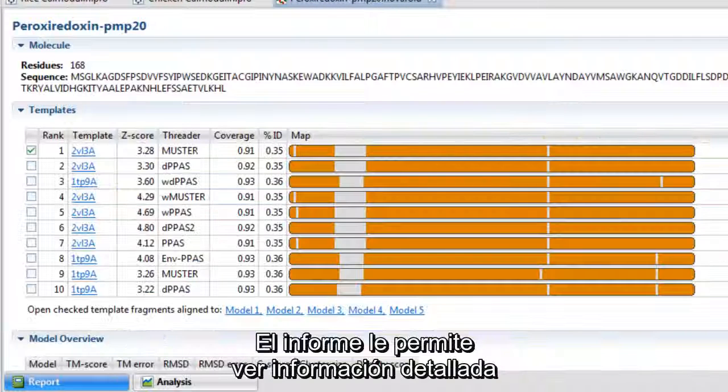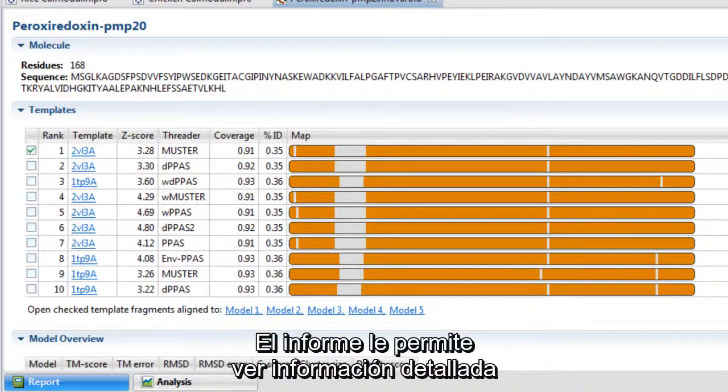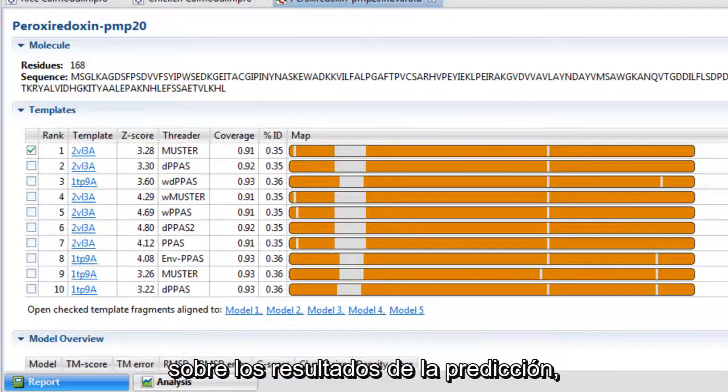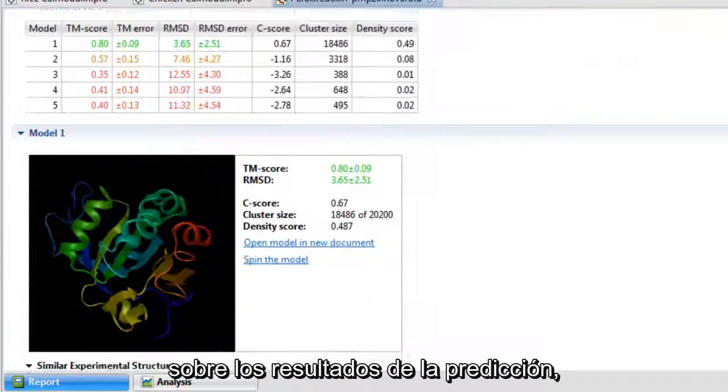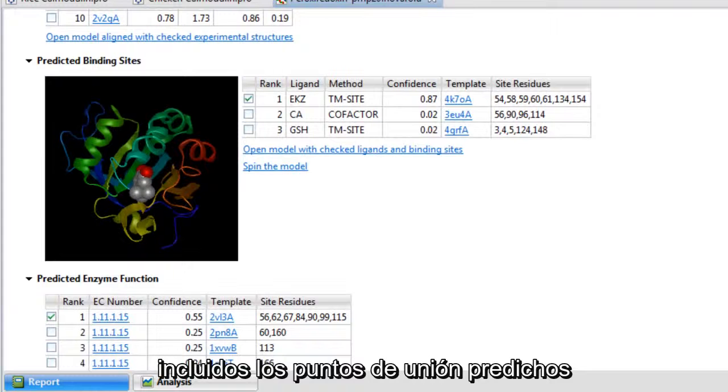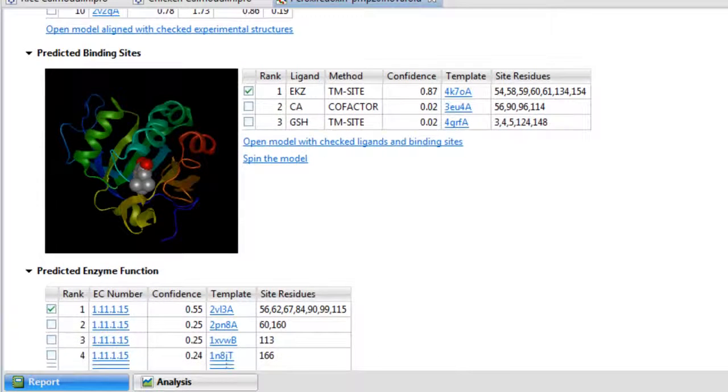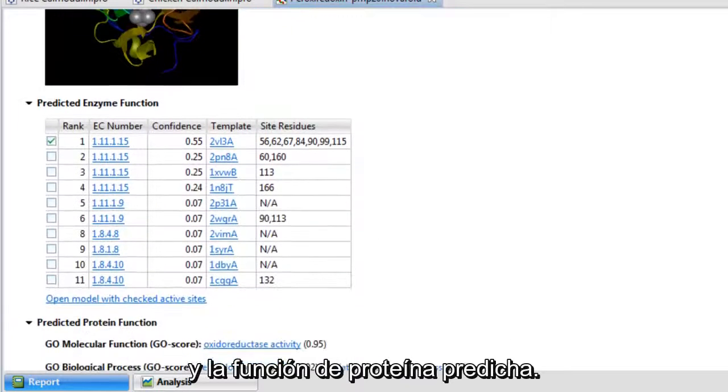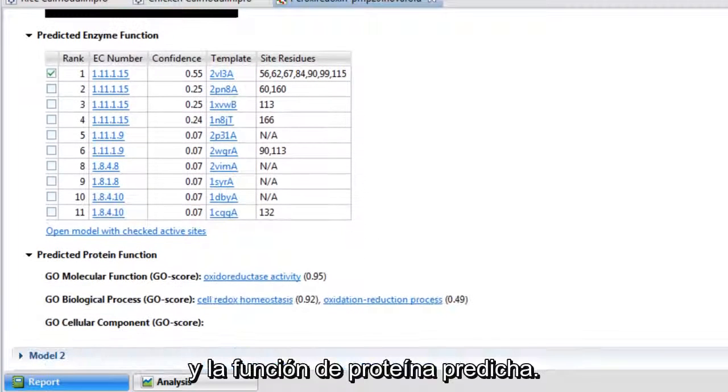The report allows you to view detailed information about your prediction results, including predicted binding sites and predicted protein function.